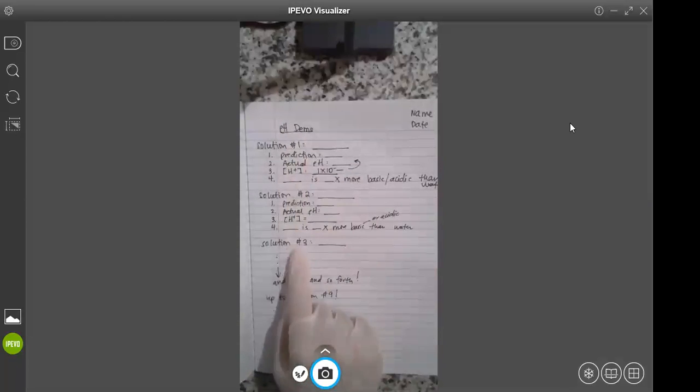Okay, so I'm going to have you set these up from solution 1 all the way to solution number 9. Okay, we're going to be doing 9 solutions. So go ahead and pause and set this up.